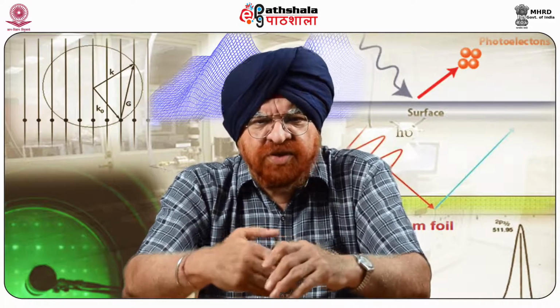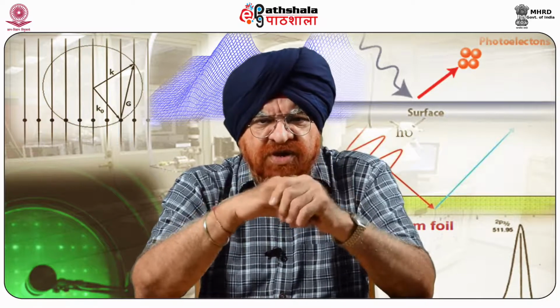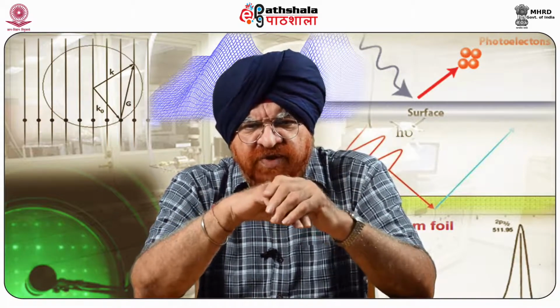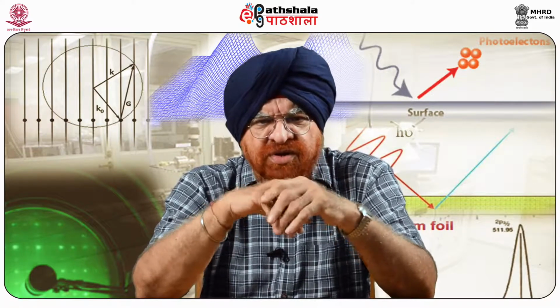Atomic force microscopy is an imaging tool used widely in fundamental research, although, like other scanning probe microscopies, it has provided only limited information about the chemical nature of the system being studied. A disadvantage of AFM compared with the scanning electron microscope is the single scan imaging size. The scanning speed of AFM is also a limitation.